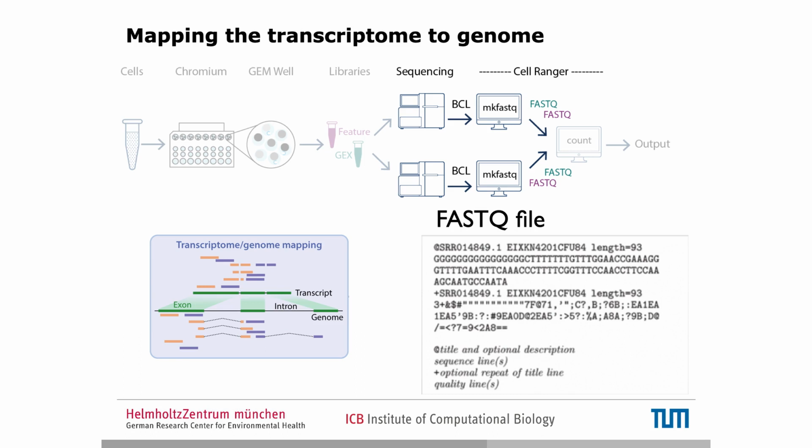So they're somewhat important to assign a read to a cell, but you don't have to look into these kind of FASTQ files one by one, because you create thousands of them, and these identifiers are designed to talk to machines rather than people. But I want you to have a look at it at least once, and that's that.